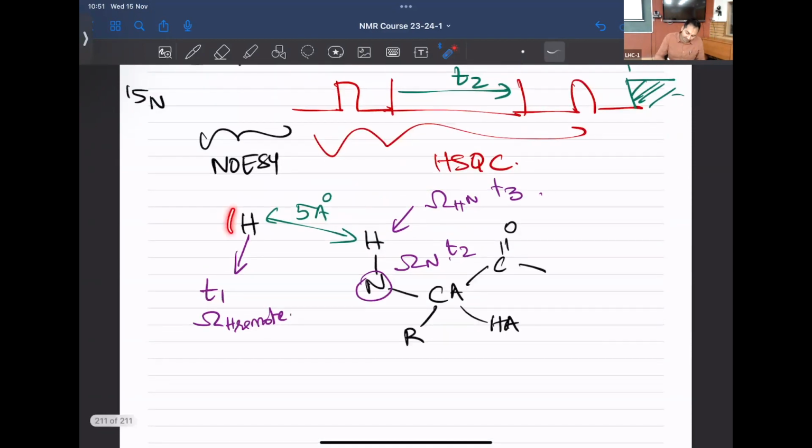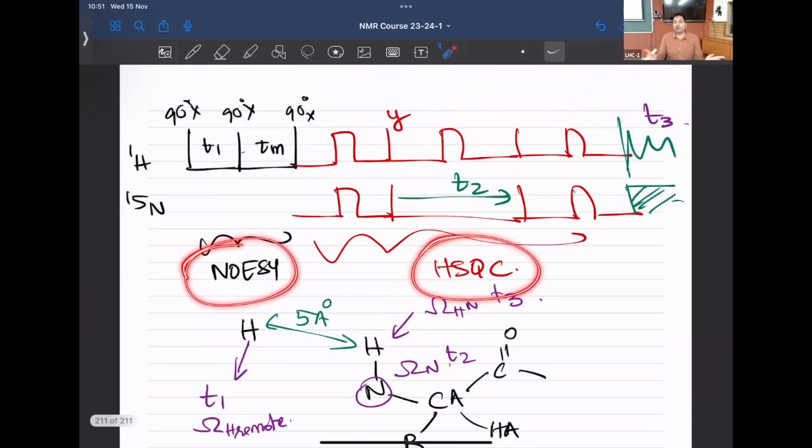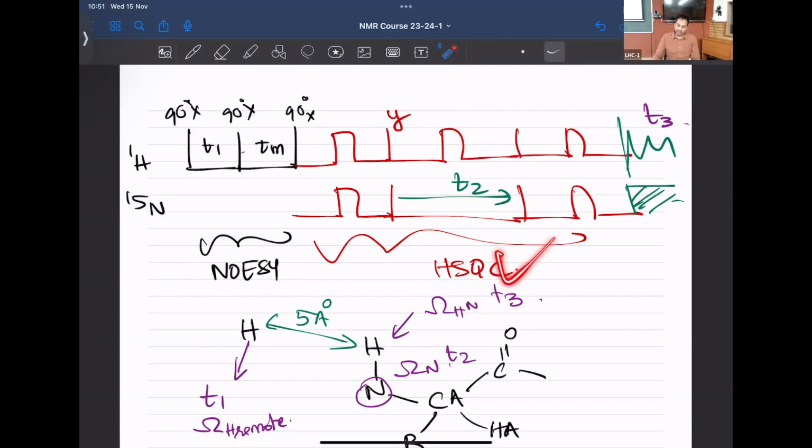How do you end up getting that? The NOESY experiment jumps from one to the other. Let's say this is the I spin, you jump to the S spin, right? And therefore you get a cross peak. But now if the S spin can be correlated to its own nitrogen, it gets additional resolution in the third dimension. Makes sense? You could always ask, why are we doing a NOESY HSQC? Why can't we do a HSQC NOESY? We need to do the HSQC first and do the NOESY jump. You can do both. But due to certain reasons of water suppression, the NOESY HSQC is a better experiment than the HSQC NOESY. Let's keep that away for the time being. You can always do a NOESY HMQC also.